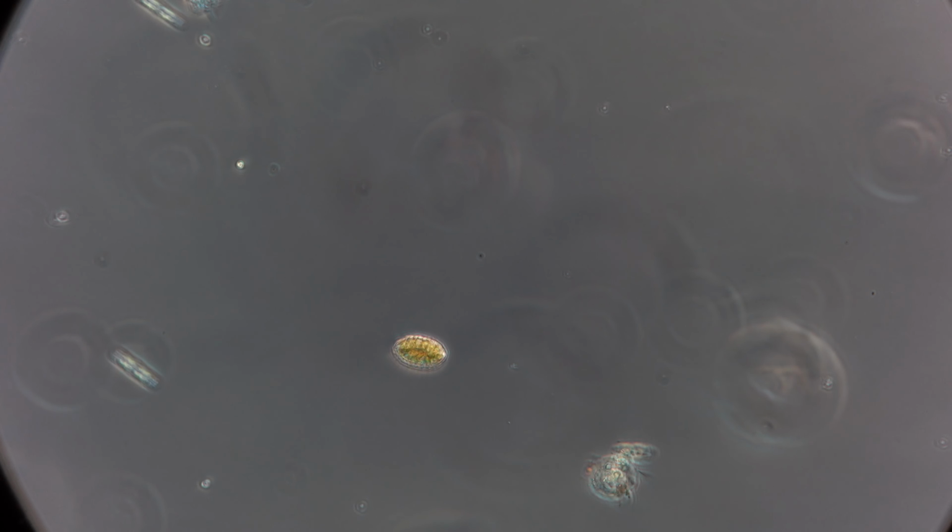Ooh, that. Which one? Yeah, that. There we go. Ooh, oh, diatom. So many different types of diatoms. I feel like whenever I experience stuff in the very micro, it feels so similar to the macro.